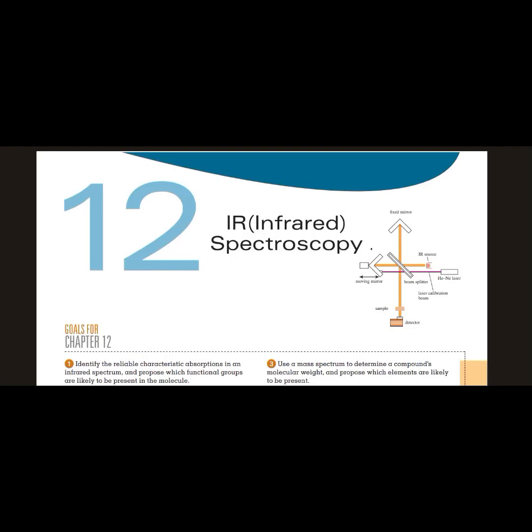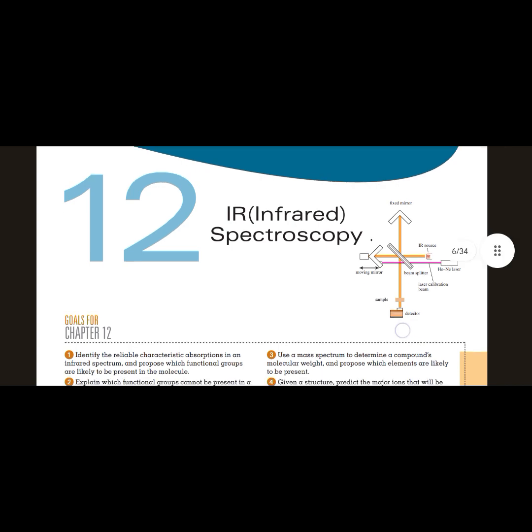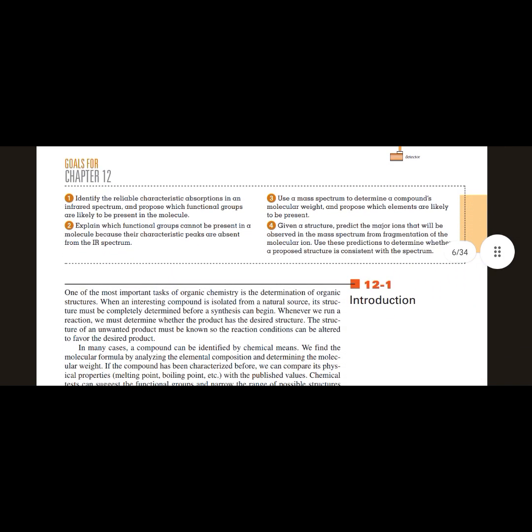Today's topic of presentation is IR spectroscopy. Introduction. One of the most important tasks of organic chemistry is the determination of organic structures.